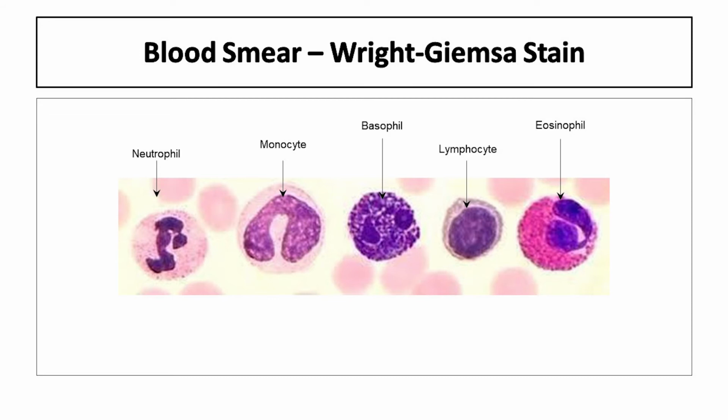Now the other two types of cell types you see here are basophils and eosinophils. Basophils are base-loving dyes. They like to take up basic dyes, so that's the name, basophil, base-loving. So they pick up purple dye here, in this case, and it attaches to their granules. So they get these nice gritty purple coloration to them, and that helps distinguish them from their companion cell type, which is eosinophils, who happen to like eosin dye. So they also have bilobate nucleuses, just like basophils. Eosinophils also have gritty, granular bits to their cytoplasm, but in this case, they're pink.